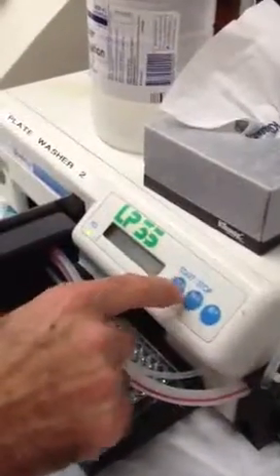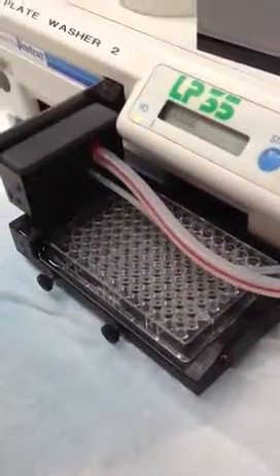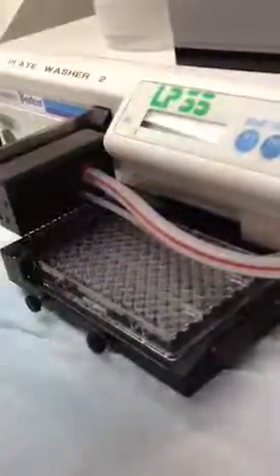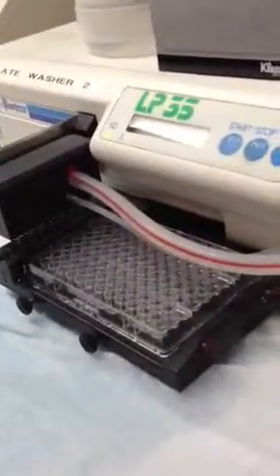Now that you're running — now it's sucking, it's not spilling everywhere. So you just run the rinse cycle. We usually give it three or four rinses at the beginning of the day. Each rinse cycle is about 10 seconds.